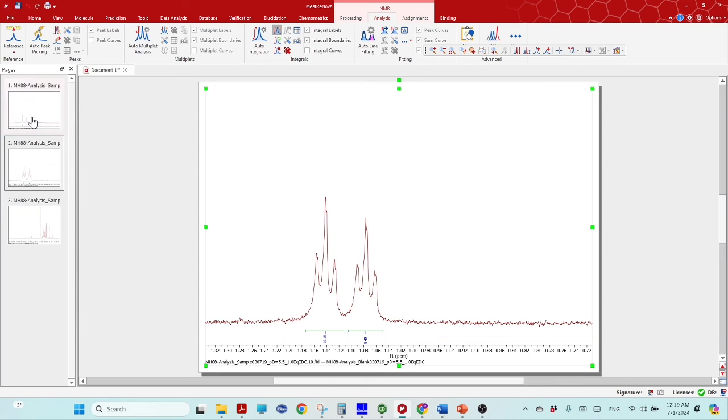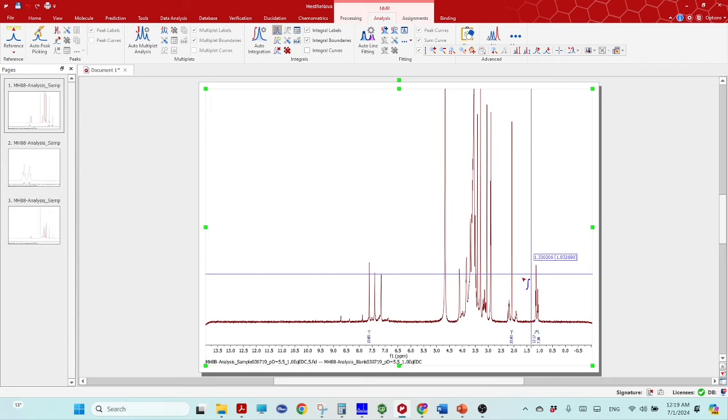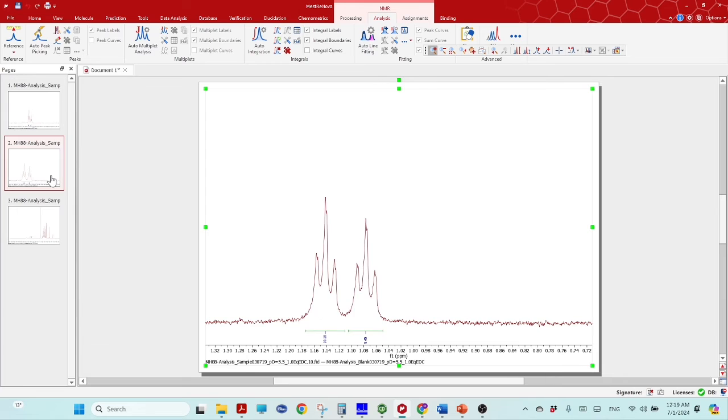So if you see just the initial of this reaction, even it was decreasing, but it is decreasing slowly. The EDC is decreasing slowly, converting to the product. So it was 12 millimolar and 7 millimolar, but in the second, like after 10 to 15 scans, maybe within 5 minutes or something, it stays 10 millimolar and urea forming 8 millimolar.